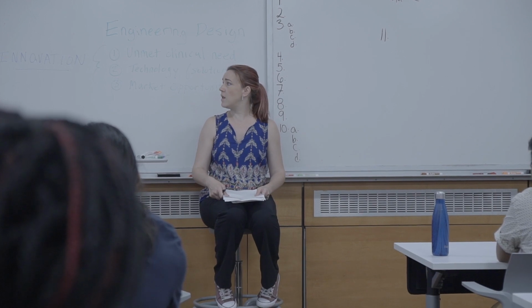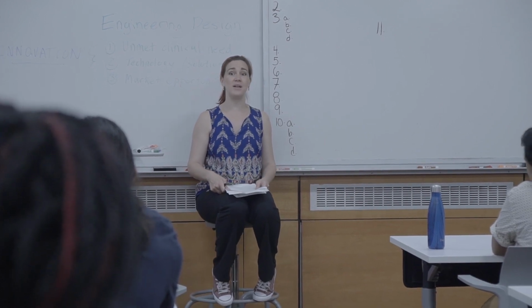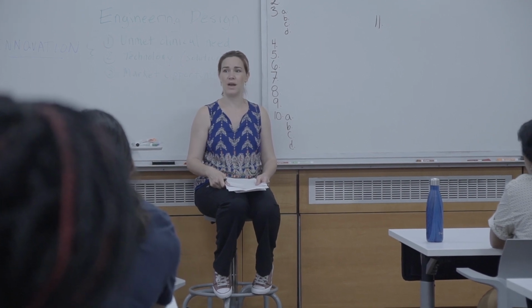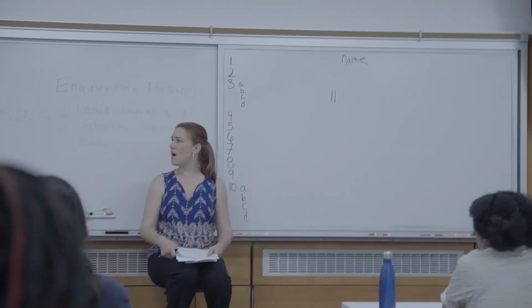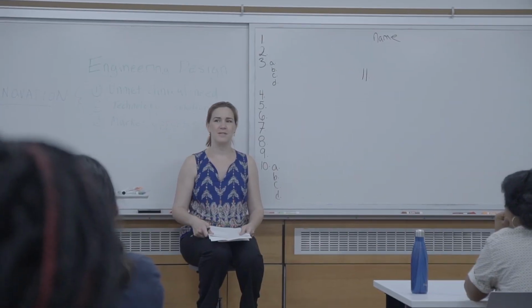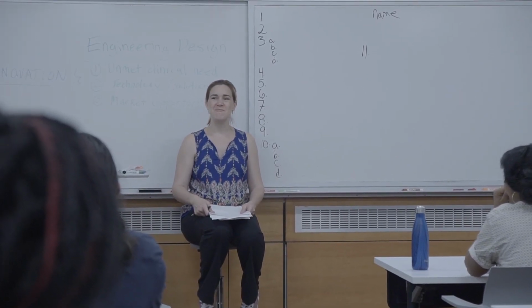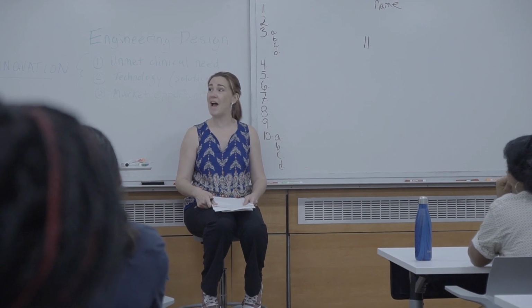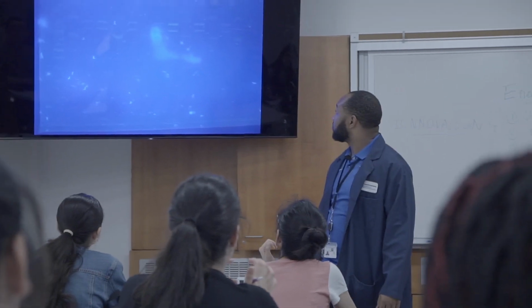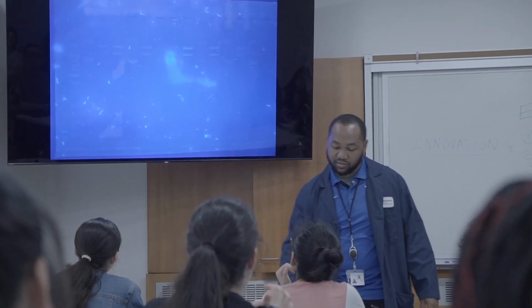And why is that? How many cuts did our enzyme make? 2. Right. So if you saw 3 bands, what might have happened? Does anyone have an idea? Problems would have happened. I've had this happen in reactions. There's one, I don't know if they had it this year, but there's definitely one, I'll show you on the next slide, that has three bands.